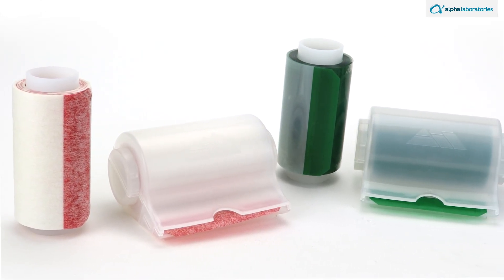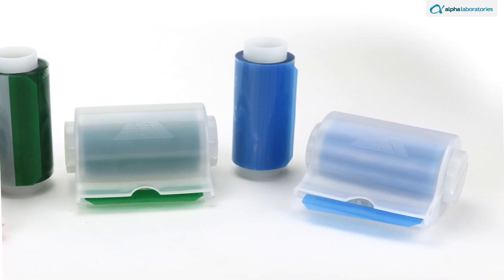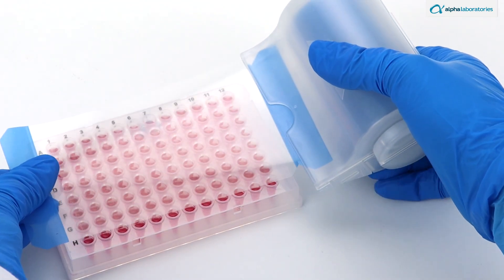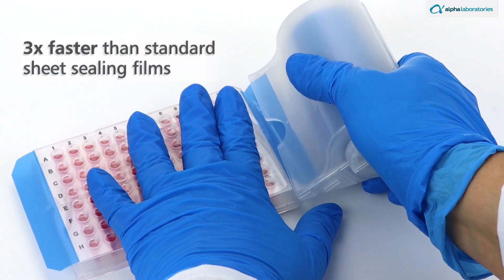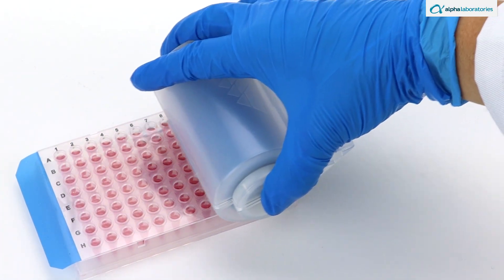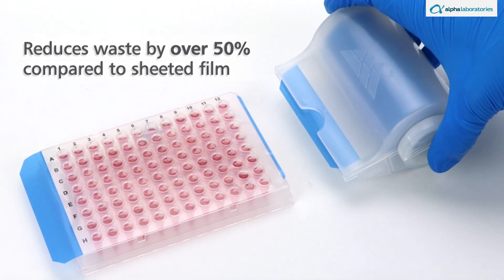Excel Scientific's unique Seal Mate system provides a convenient method for sealing standard format microplates. The adhesive film rolls and dispenser offer convenient and efficient application, being three times faster than standard sheet sealing films. They also minimize waste by removing the need for the protective backing typically used with individual seal sheets, reducing waste by over 50% compared to sheeted films.